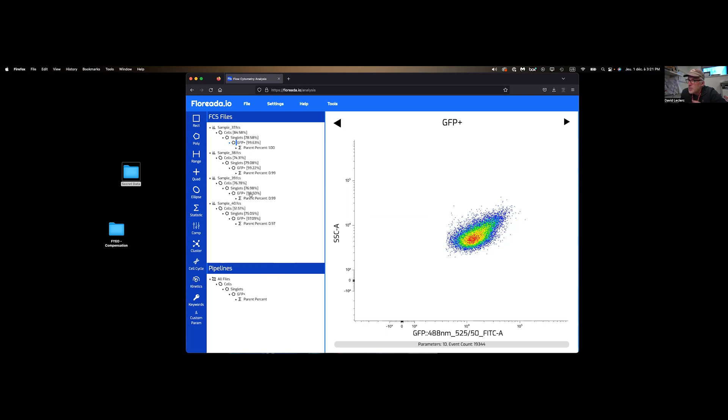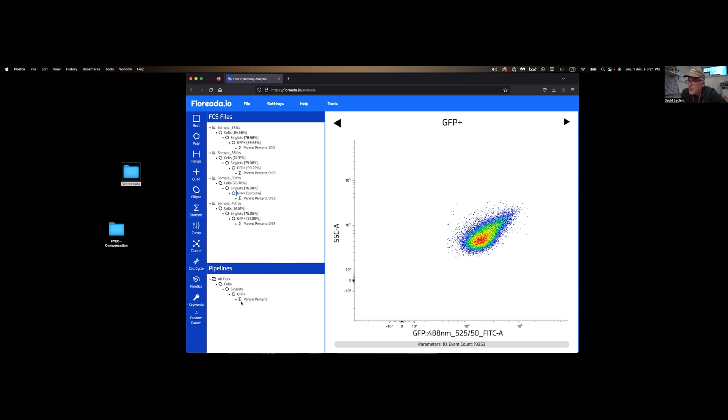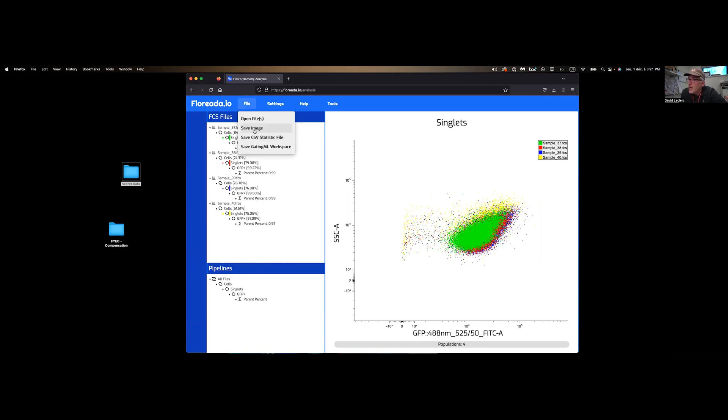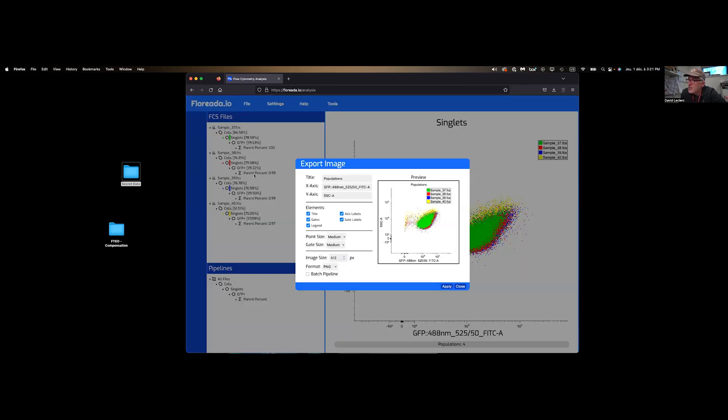But at this point, my screening is pretty much done and I'm pretty happy. So I can now export the data fairly simply. You can either select on the pipeline one of the gates that you've made. And maybe singlets would be more appropriate. Go to file. And we can export the CSV statistic file or the image. If I click on image here, this is what we're going to be getting.